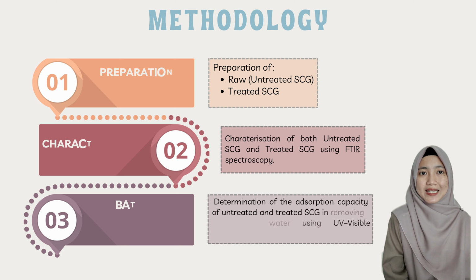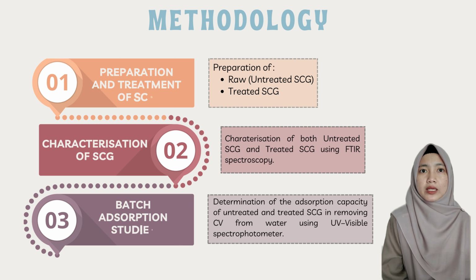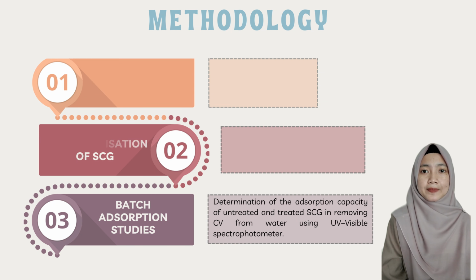We approached this in three steps. This is the overview of our methodology. First is the preparation and treatment of the coffee grounds. Second is characterization using FTIR spectroscopy. And the third one is batch adsorption studies.